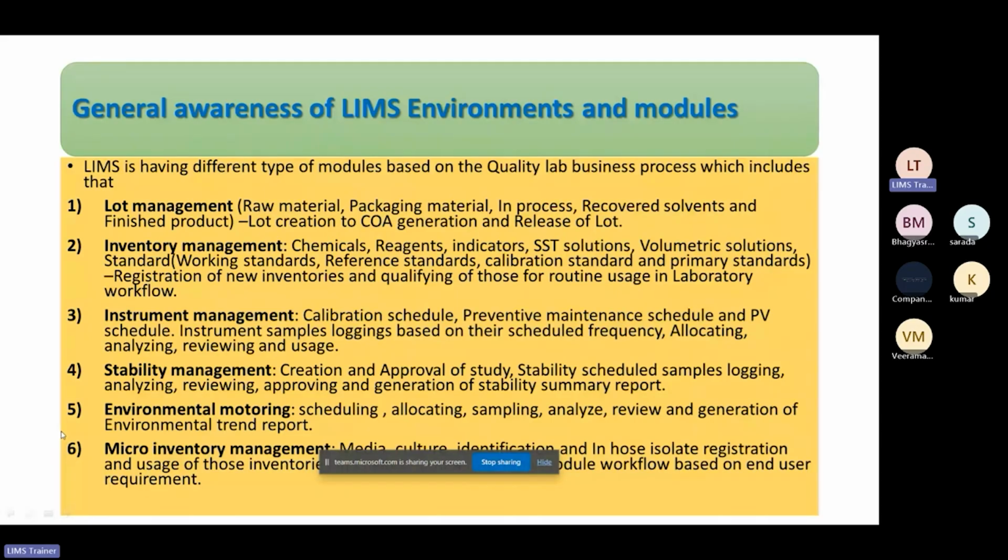Then comes inventory management. There are many chemicals, reagents, indicators, and all the records will be maintained; all the inventory will be managed by this LIMS software. Then comes instrument management.